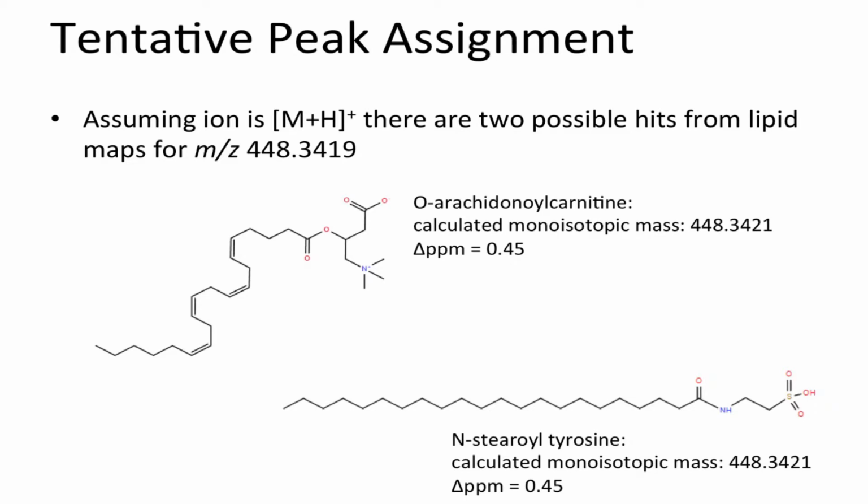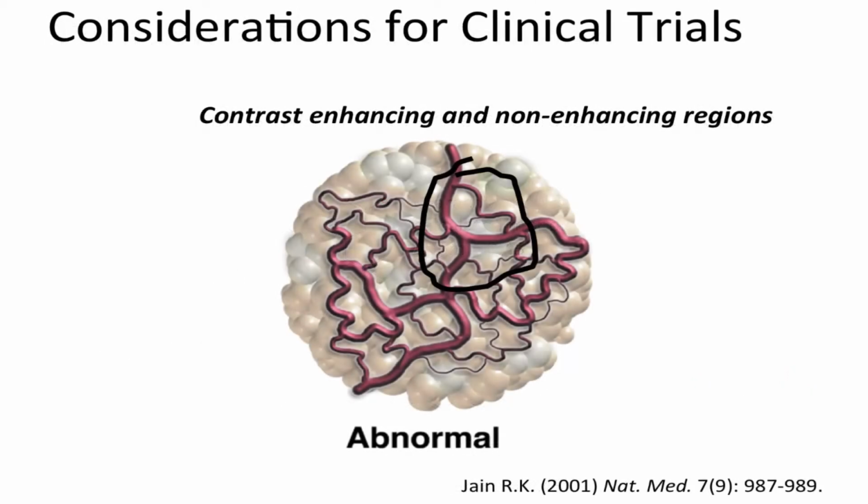So because we're using a high resolution instrument, high accuracy, based on the mass itself, it seems like that molecule could be one of those 2 here. But we will be looking more into it to see if this one or any other one that we could pick up could start being a bridge between the tumor response and what we're seeing with the phosphoproteomics and mRNA sequencing. So basically not just looking at the target itself, but seeing some responses when the cells start responding to the drug.